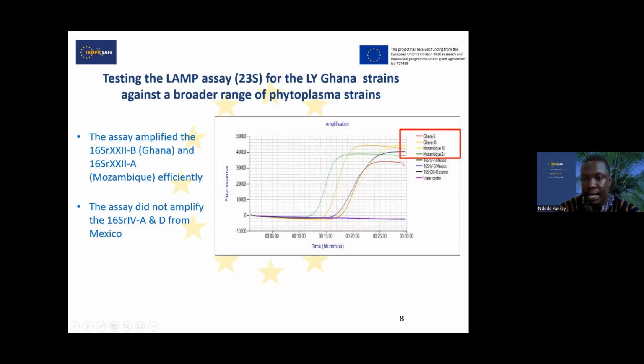The assay, however, did not amplify samples from Mexico. And this is typically the output you get from the real-time LAMP.